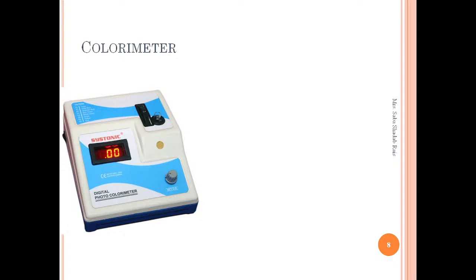Now in which case will these three things happen? Reflected back, that means it may be a mirror surface. Okay, maybe it is a metal. So in the case of a mirror or metal, when electromagnetic radiation falls, it will be reflected back. This is not useful for our work.